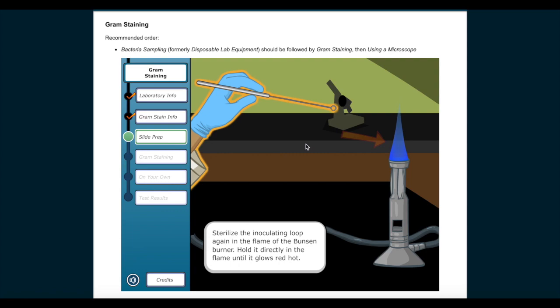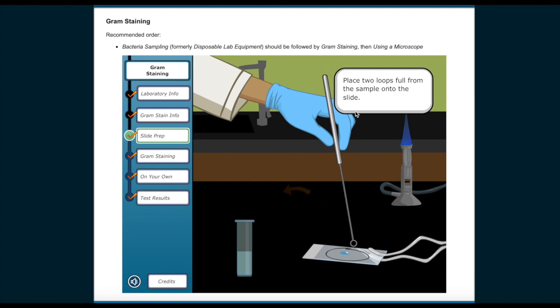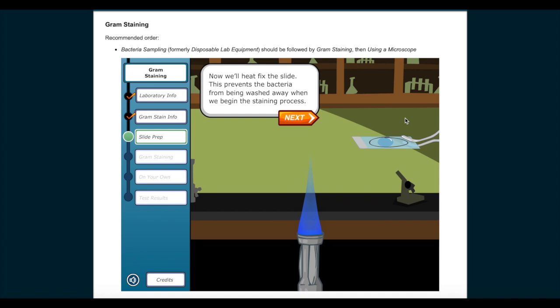Use the inoculation loop to transfer a small amount of sample from the test tube to your prepared slide. Sterilize the inoculating loop again in the flame of the Bunsen burner. Hold it directly in the flame until it glows red hot. Transfer a small amount of sample from the test tube to our prepared slide. Place two loops full from the sample onto the slide. Tilt the slide to spread the drop out slightly, about the size of a penny.